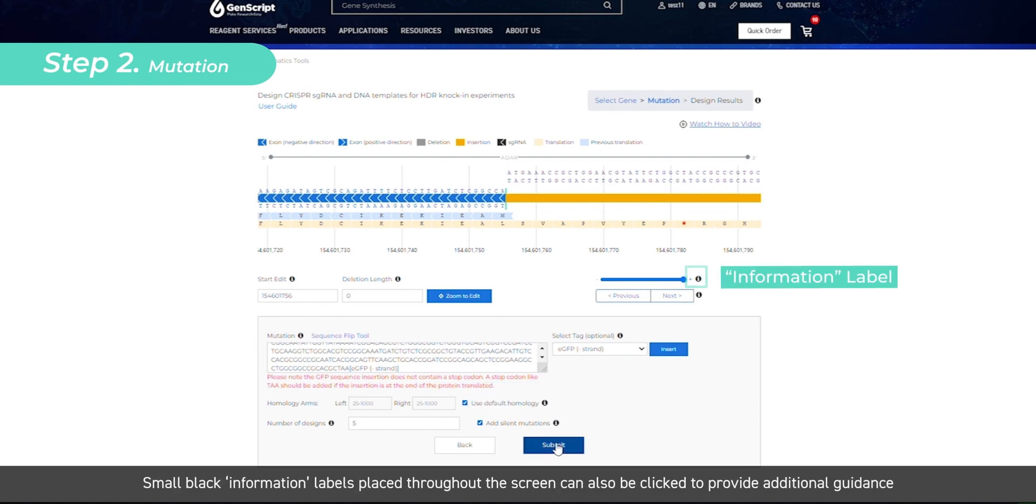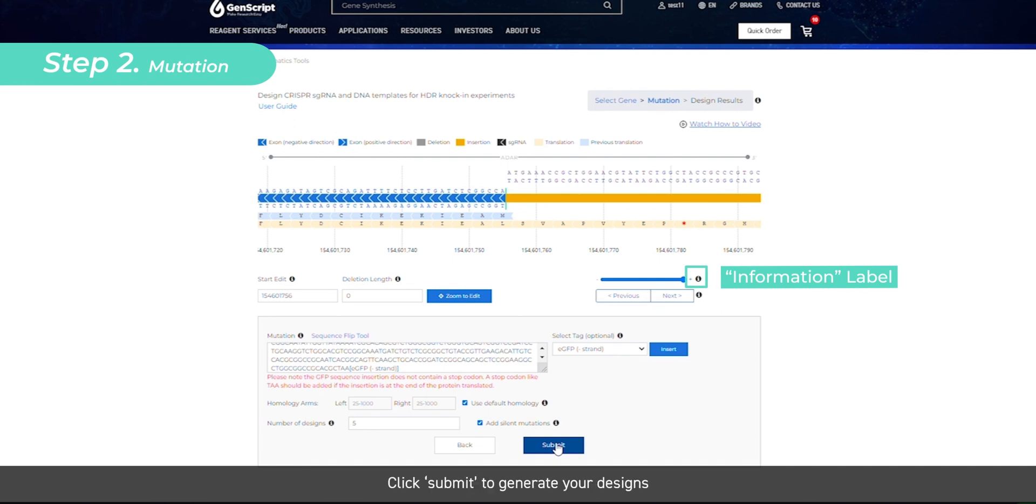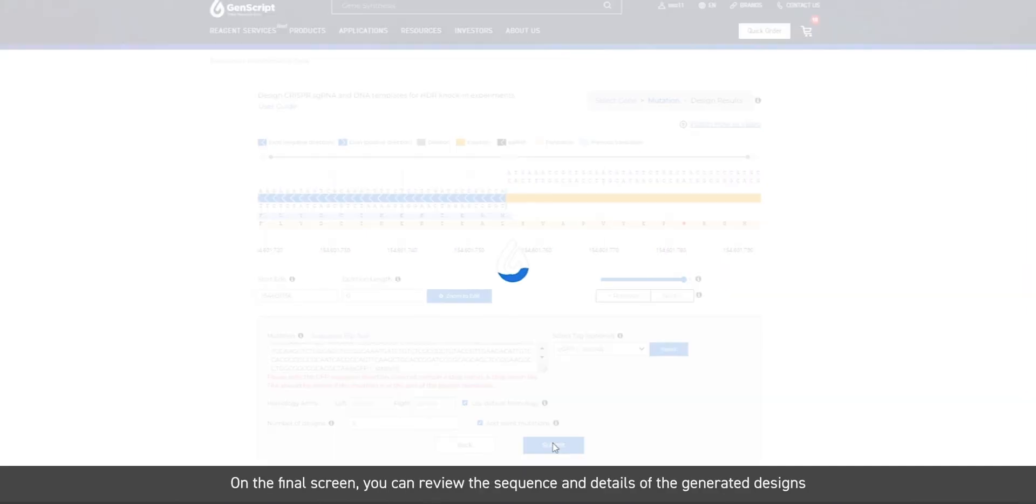Small black information labels placed throughout the screen can also be clicked to provide additional guidance. Click submit to generate your designs.